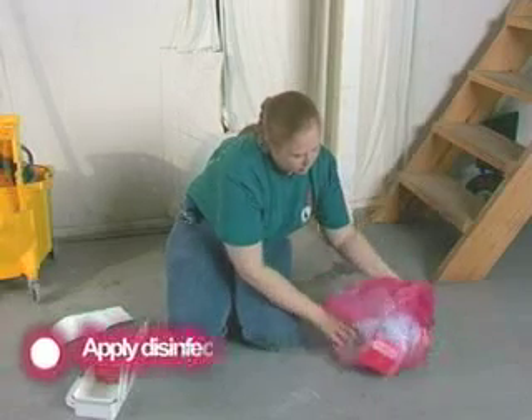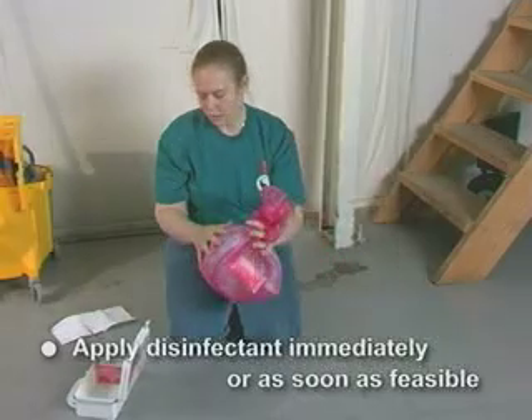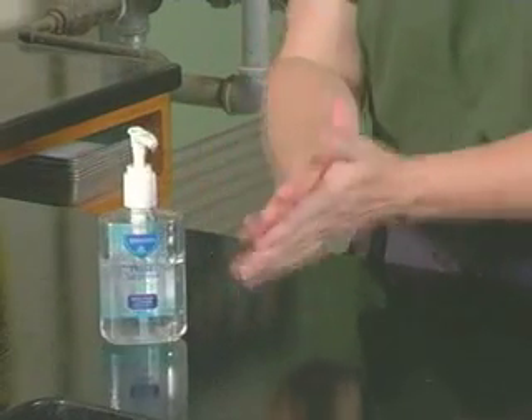Apply a disinfectant to the area immediately or as soon as feasible. Thoroughly wash your hands.